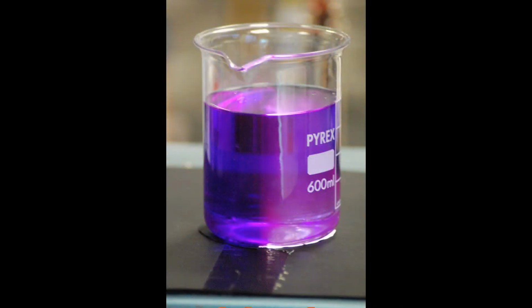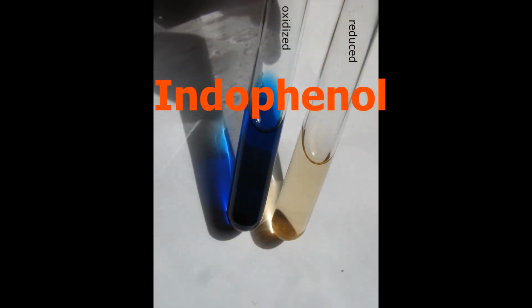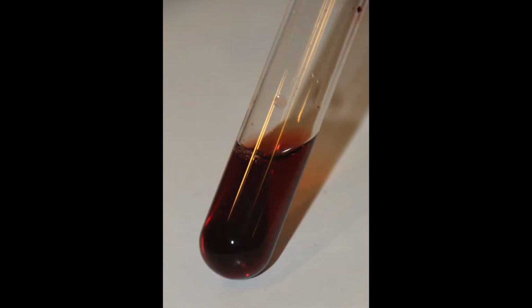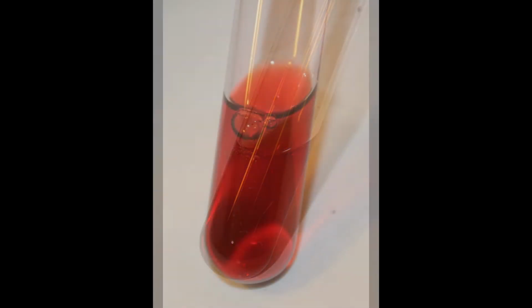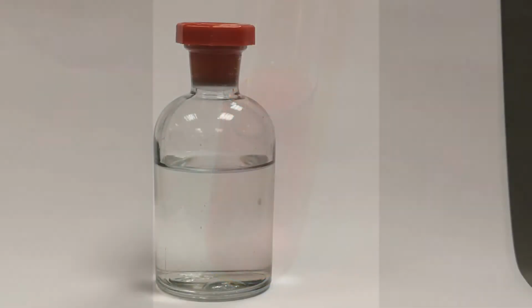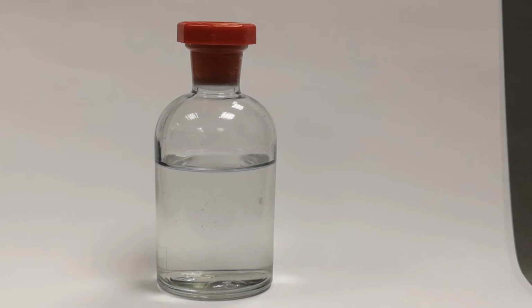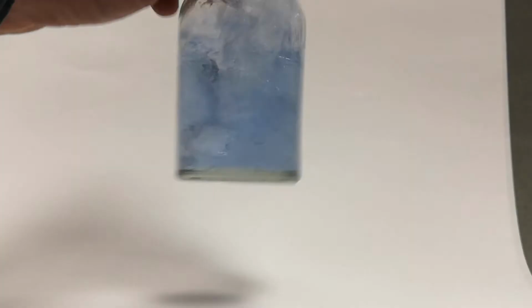You're all, I'm sure, familiar with acid-base indicators, which change colour depending on the pH of the solution. Well, there's another class of indicators called redox indicators. These change colour depending on whether or not they are in an oxidised or reduced state. One of the most well known is methylene blue. The oxidised form is, as the name would suggest, blue, while the reduced form, known as leucomethylene blue, is colourless.